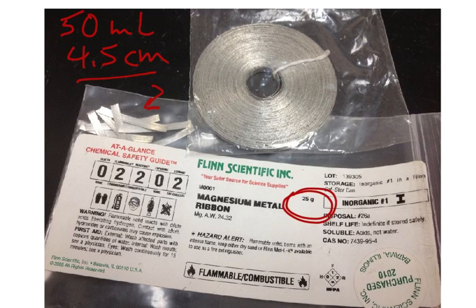And you can see here the little pieces of magnesium ribbon that we have for you. So you're going to get one of those and you're going to measure it out. Now it turns out it really doesn't matter how much you have. What does matter is that you know how much you have. So we're going to measure it carefully.